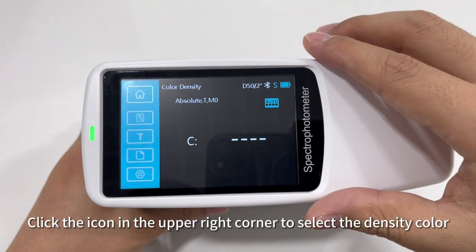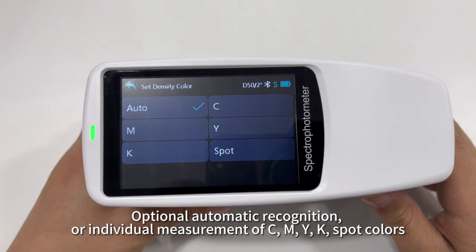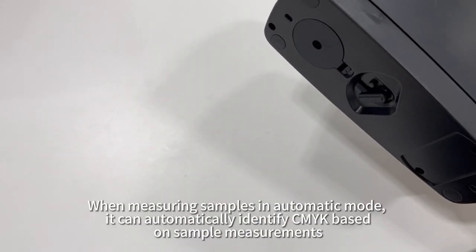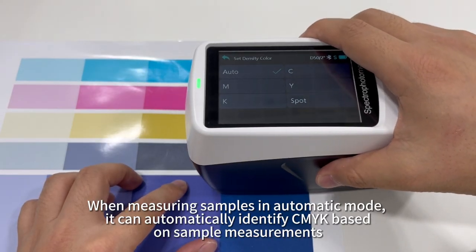Color density demonstration. Click the icon in the upper right corner to select the density color. Optional automatic recognition or individual measurement of CMYK spot colors. Auto mode demonstration. When measuring samples in automatic mode, it can automatically identify CMYK based on sample measurements.